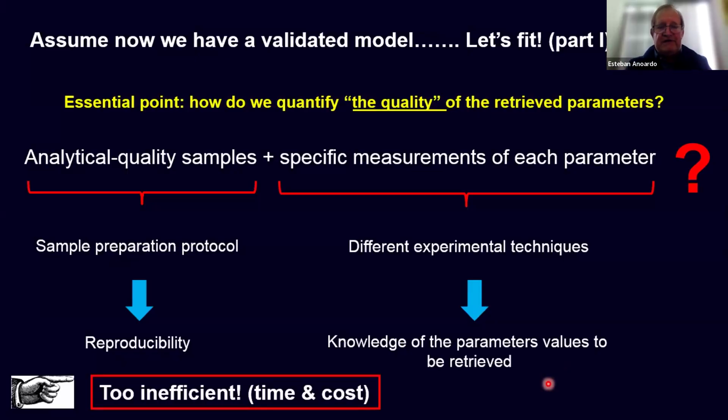What is the problem with this approach? It is too inefficient, extremely costly in time, and also you have a cost in the samples because liposome samples can be used for two to three days maximum. So you have to reproduce samples and measure. And to have two, three, four profiles, you can get one or two profiles, maybe three profiles per day at maximum, sleeping just a little bit. Anyway, so this is one approach.